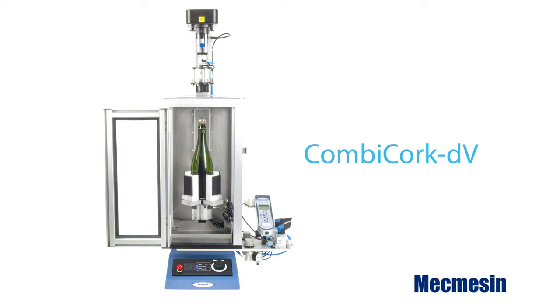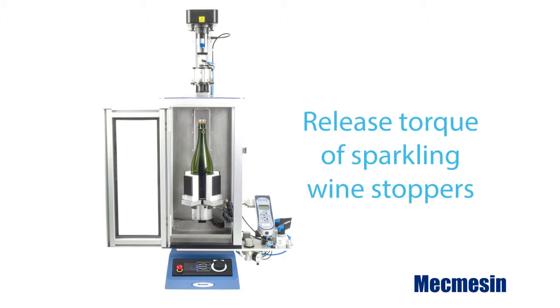The CombiCork is a dedicated tester for objectively measuring the removal torque of corks from sparkling wine bottles.